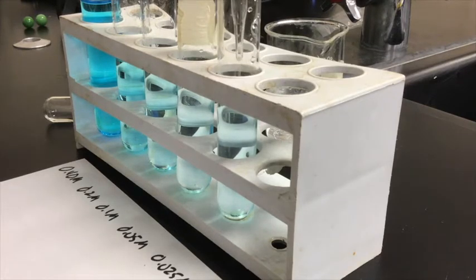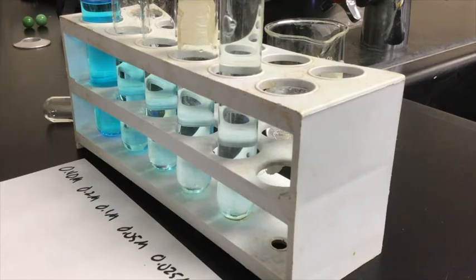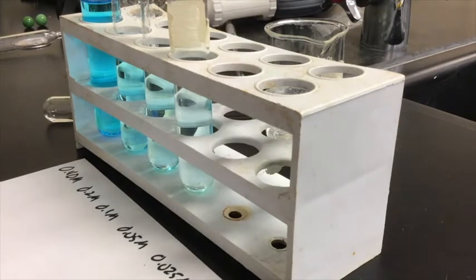That is 10 of water. And now I have 5 different solutions, all of which I know the exact concentration for because I set them up myself. Put the cap on this, give that guy a shake, like so.